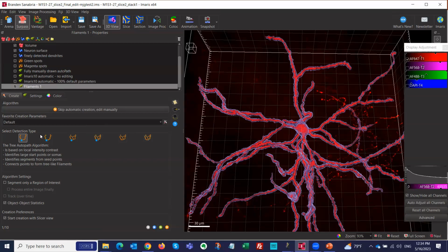Basically, the first thing you notice is this little icon. There are 6 different possible types of structure that you can extract, okay? We can have the soma and dendrites, and spines, no loops. Here there are loops with soma, and then there's no soma and loops. So the vasculature is this one here, because we typically have interconnections and we don't have a soma.